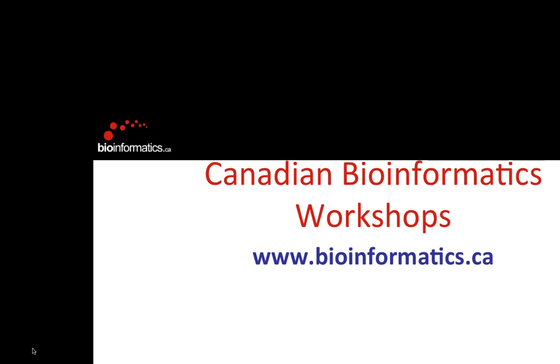So the first module is about using R and XCMS for processing LCMS spectra. This is going to be a lecture you follow, so it's also a practical lab. But we're going to have lots of time, so I'm going to slow down a bit, and at the same time, if you have questions, stop and ask questions.